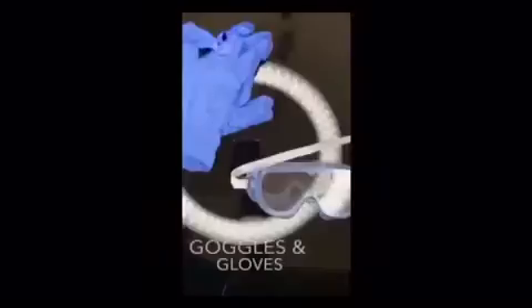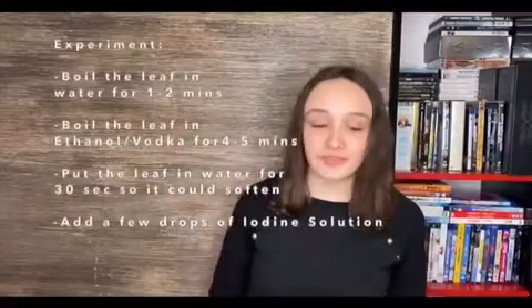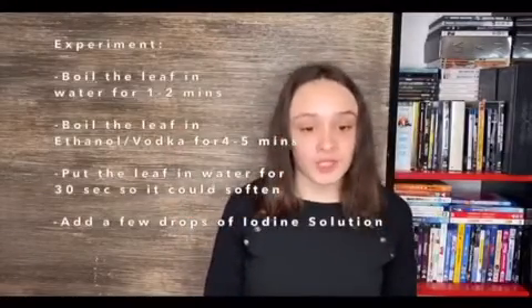What we'll do for the experiment is: boil the leaf in water, boil the leaf in ethanol, add the leaf back in water, and then put iodine solution on it. So let's start the experiment.